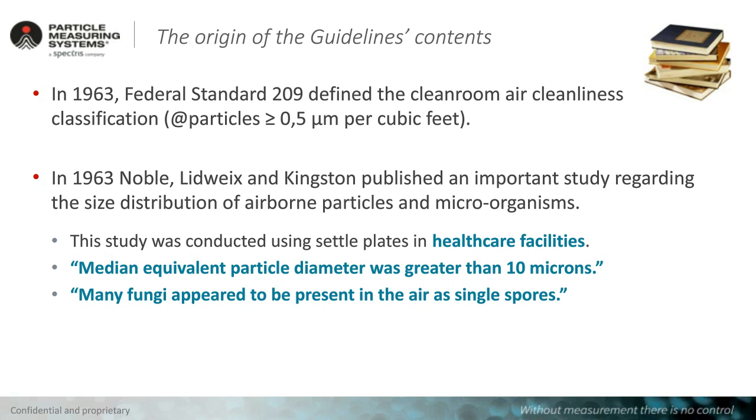This is directly linked to a study that Noble, Lidwell, and Kingston published regarding the size distribution of airborne particles and microorganisms. You need to understand that this was done in healthcare facilities, mainly hospitals and similar settings. The median equivalent particle diameter was greater than 10 microns. This is important to know because we later come to the point of particle deposition, and 10 microns is important information.